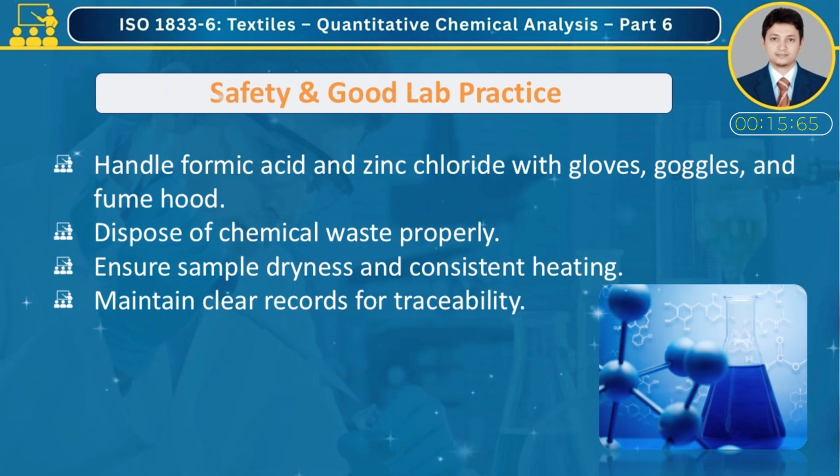To summarize, ensure proper sample identification, precise reagent preparation, controlled heating, and careful weighing. Consistent adherence to these practices ensures reliable results and compliance with ISO laboratory standards.